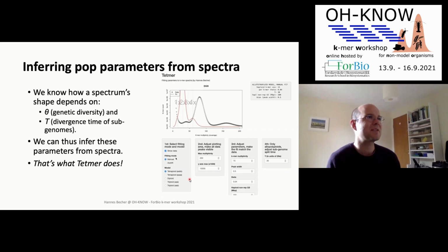In a way, there's relatively little information in these K-mer spectra. And that's what all of us say, a K-mer spectrum analysis is sort of a quick and dirty thing. You can do that before you have an assembly. But if you have an assembly of an allo-polyploid, you will be able to say much more accurately what's going on. Is the effective population size different? Is the nucleotide diversity different in the different subgenomes? So I'm actually not so eager to make it more complicated there. Sure.